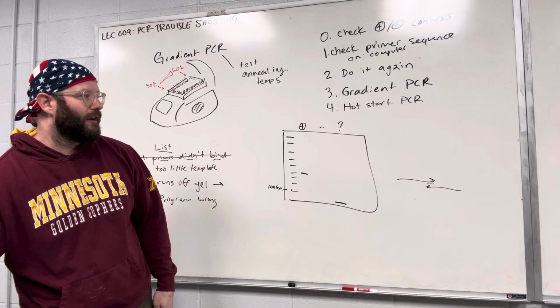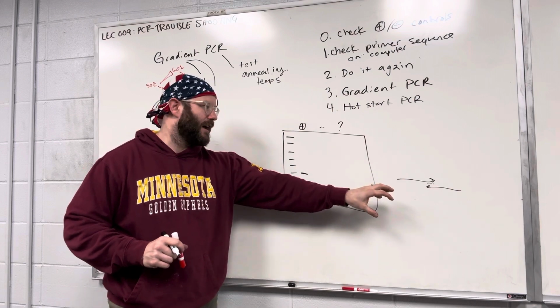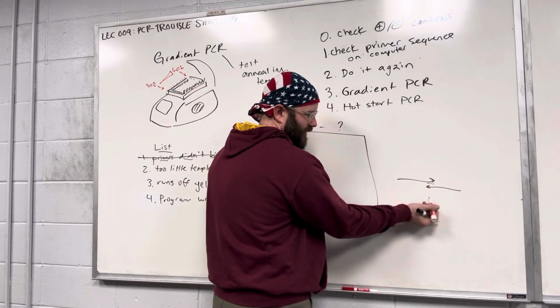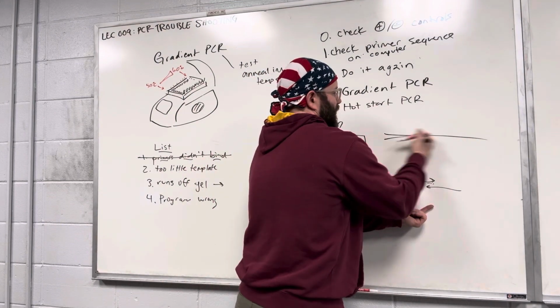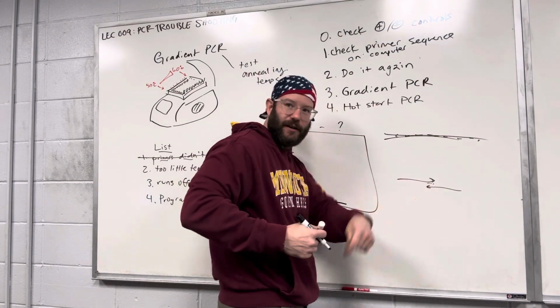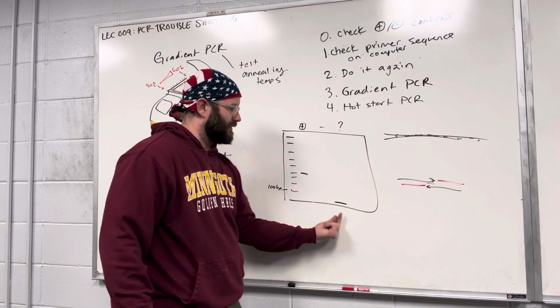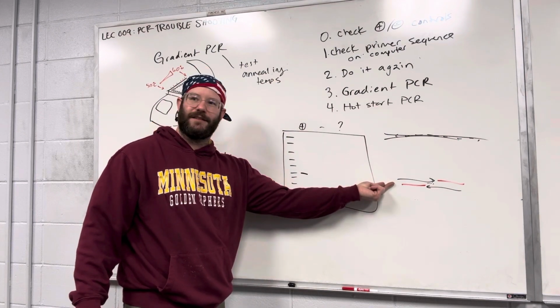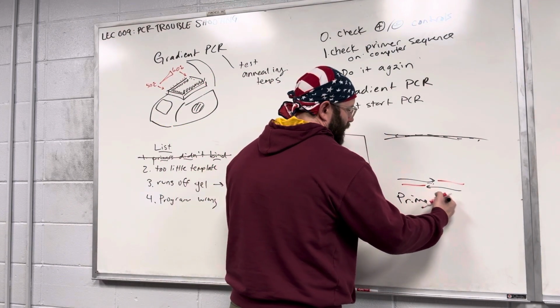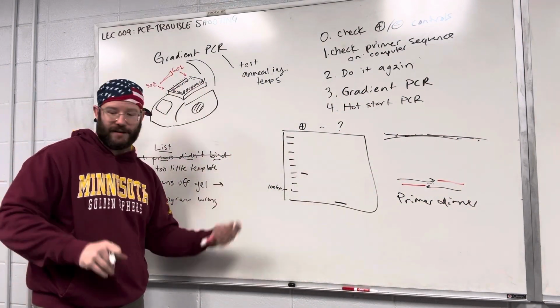What will get written? When the polymerase comes on and does the extension step, what will get written then? The primers. Yeah, the primers. Okay. So if this is happening, instead of binding to your template, that's DNA, when the polymerase starts the extension, it's gonna write this and this. And this is gonna produce a tiny band, that's a tiny size, okay? That runs at the bottom of your gel, and this is called a primer dimer. That's a super common problem, happens all the time, but it has a really easy fix, okay?